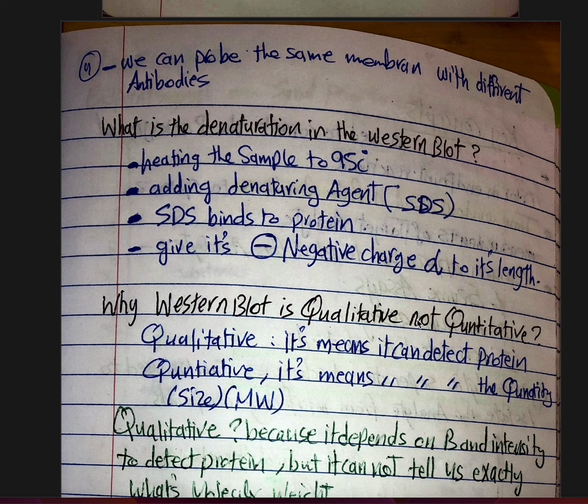So the proteins will be the same in charge and unfolded in shape, but they are different in size, or we can say molecular weight, so we can separate them depending on the molecular weight.